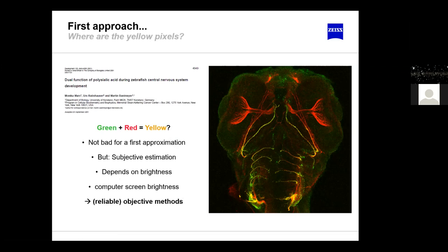The first question is: does green and red always equal yellow? It's not bad as a first approximation, but it depends a lot on subjective estimation — it depends on brightness and computer screen brightness. If we mess around with the brightness and contrast of our display, we can make any pixel turn yellow as we want, so it's a little arbitrary what we can paint yellow or not.